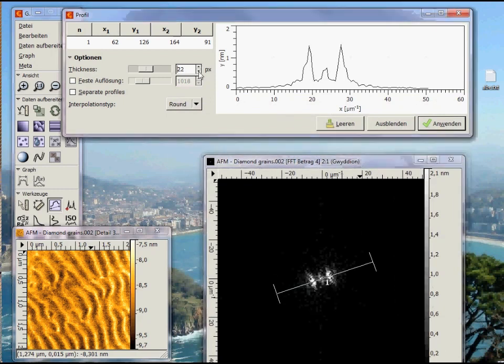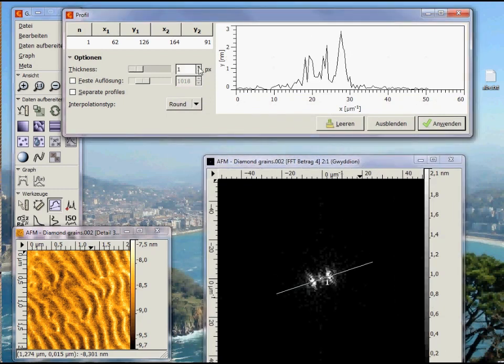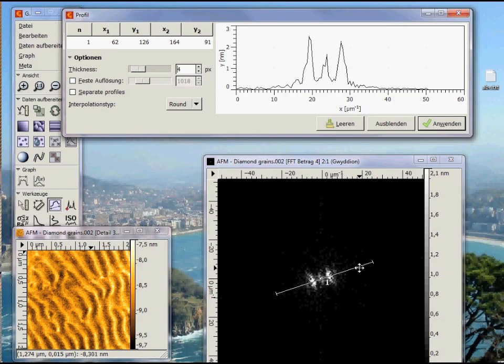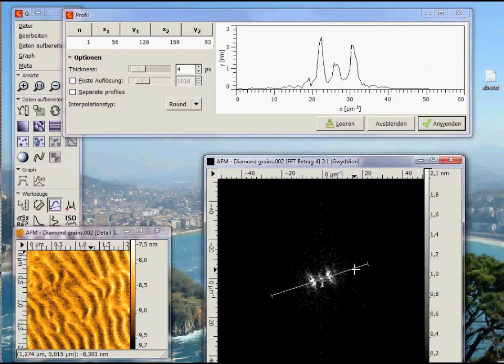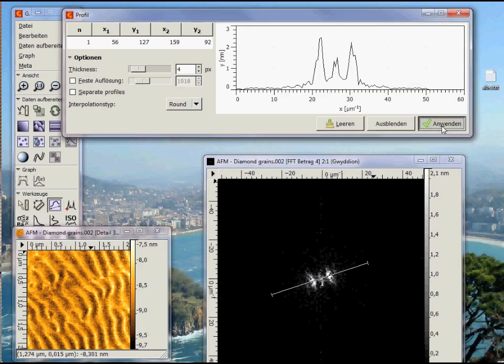We can average over several pixels if we want. Let's take 4 pixels. Applying gives us a new window with the line profile.